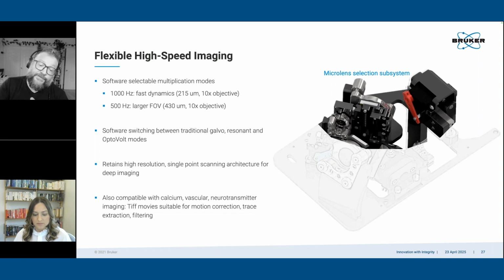So yeah, it would work as a focus extender, but I can't imagine you get much more than a few hundred microns out of it. If that's enough, then yes, it'll work. And I should say that also depends on the objective as well. So lower magnification objectives will give you a longer range.